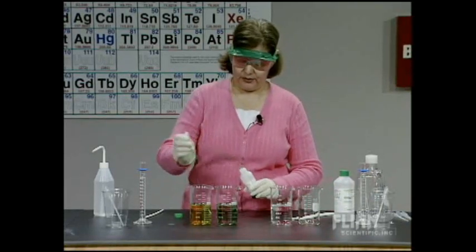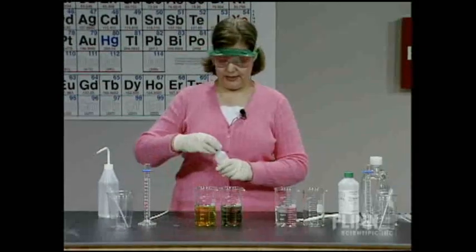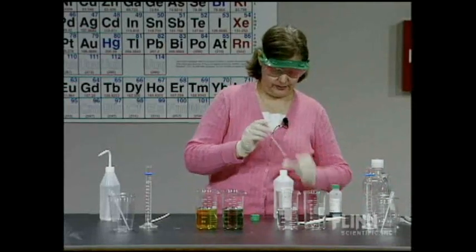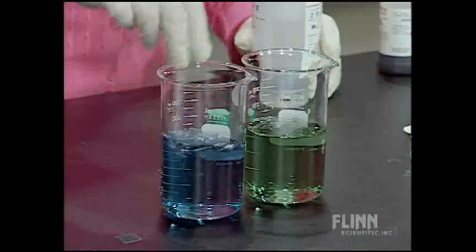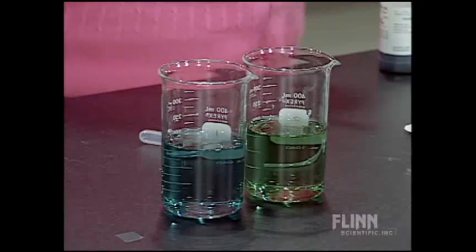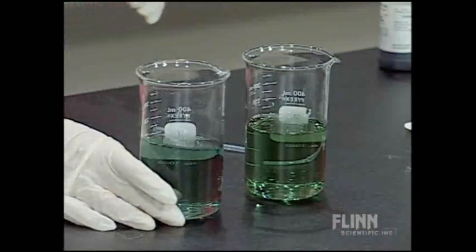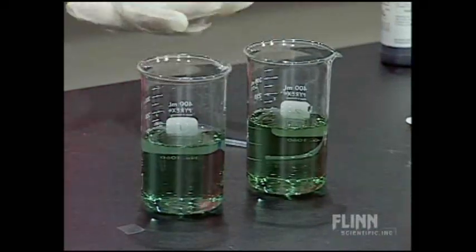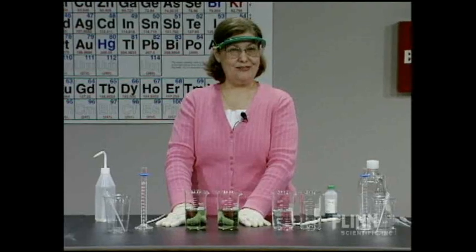Bromthymol blue is an acid-base indicator. It's yellow in acidic solution below pH 6, and blue in basic solution above pH 7.6. It's green in the neutral range, approximately pH 6.0 to 7.6. After letting them equilibrate, both solutions show the same shade of green — almost exactly the same pH — indicating both are neutral to start.